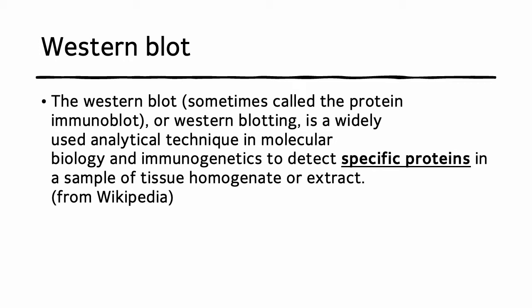In terms of IP, immunoprecipitation, you can pull down the whole protein pool with a specific antibody. If you want to see if protein A and B bind together, you can pull down the protein sample with the antibody of protein A, and if they bind, you can detect protein B from the sample pulled down with protein A, because they are a complex.